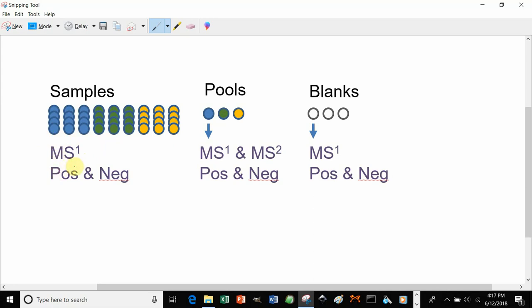You can run in just a single polarity if you desire, although we recommend using both polarities because you'll get additional information and more identifications.